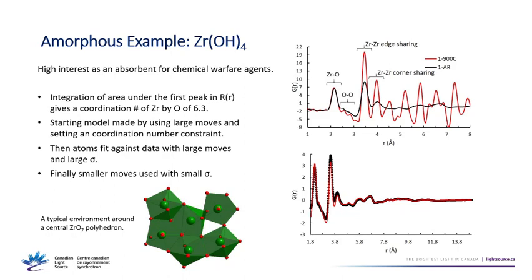And then I was able to extract statistics about coordination numbers for different atoms and bond lengths and bond angles, and develop a typical local environment for a zirconium atom in the material.